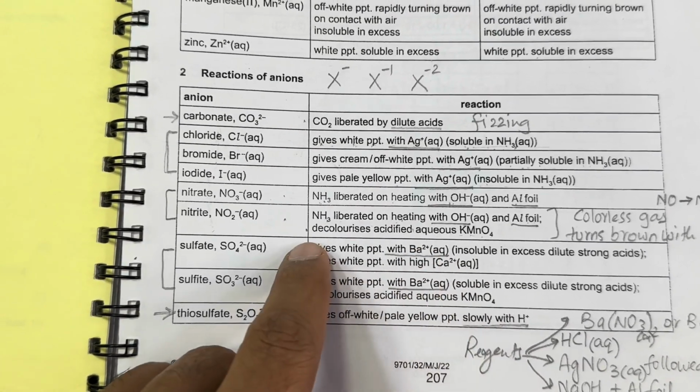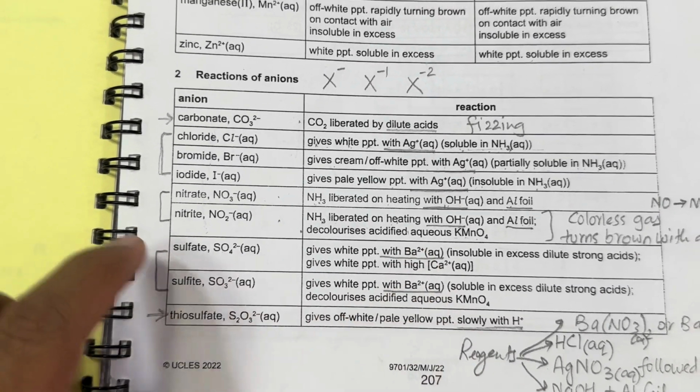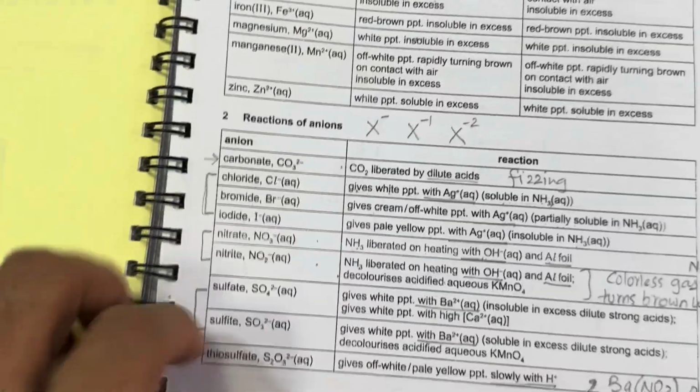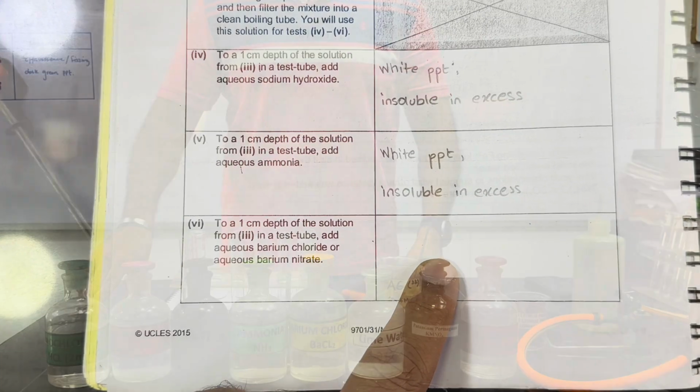So we get white precipitates upon addition of barium salt. This is for sulfate or sulfite. It means in the last part they have asked you to detect sulfate or sulfite. Let's perform this test now.